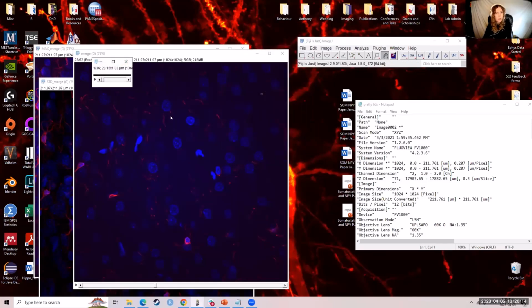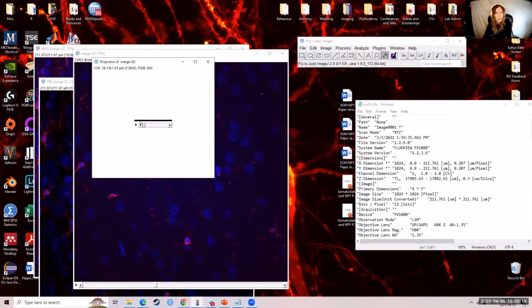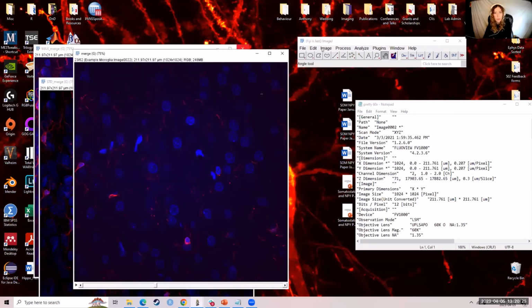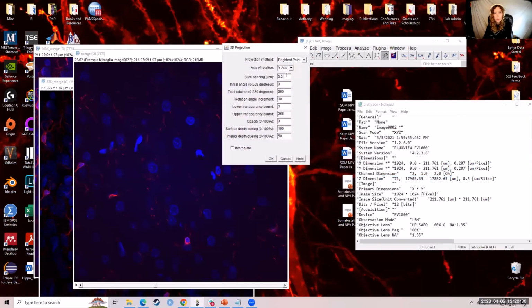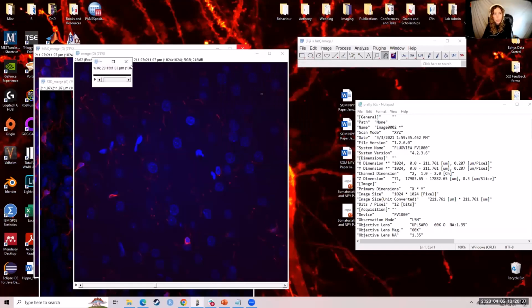And what is this doing? That is very weird. My Fiji updated this morning, so that might have something to do with it. I will try one more time, and if not, I will troubleshoot that off camera and drop that in chat later. Yeah, okay, so it looks like either my slices are showing up as time points. That could be one source of the problem, or there's something new from my update this morning that I need to figure out still. So we'll sidebar that for now.